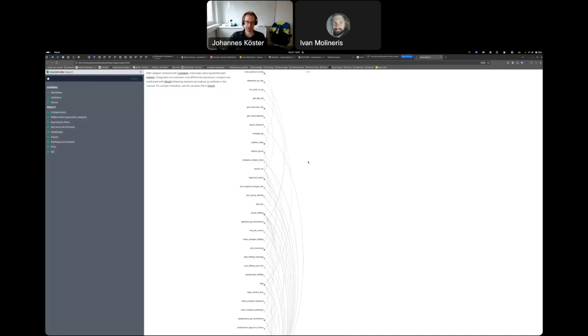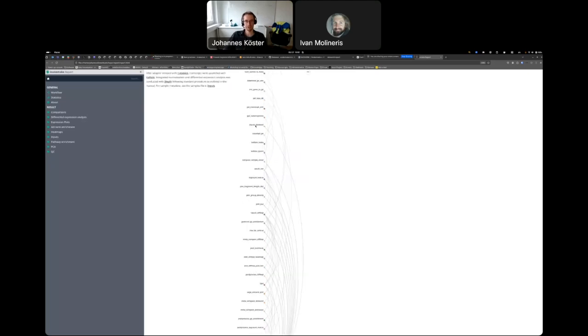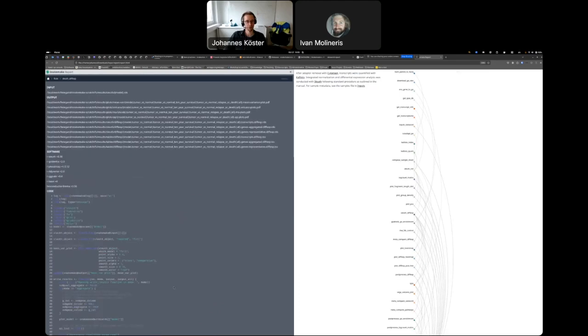So we basically look for different gene activities between different conditions, and the workflow has a lot of steps, as you can see here. This display kind of shows them in topological sorting so that you can roughly see what comes after each other. And if you're more interested, you can look at individual connections, of course. Again, you can look into, say, the details of individual rules, and you can see that this can get really involved. And for really complex workflows, it still allows you to kind of explore only the parts of the code base that really matters to you.